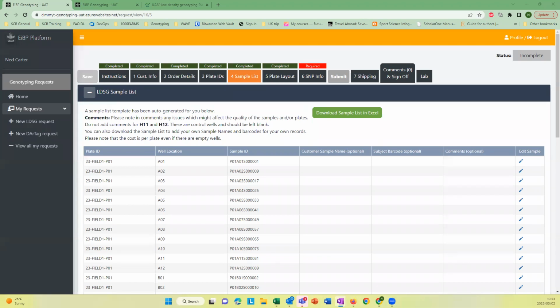The users then have to be very careful. There's a lot of what's known as validation in the programming, because people can't change the other columns, as Anna said. And if people make mistakes when copying and pasting their own data into the customer sample name column and don't notice, they'll be introducing those errors into the system. It won't matter to the lab analysis, because the lab will essentially ignore this column, but it can be done. As Eng said earlier, this was the minimum viable product. This was the simplest first step in addressing everybody's needs, and as good comments like yours are raised, Ismail, they'll be addressed in the future.